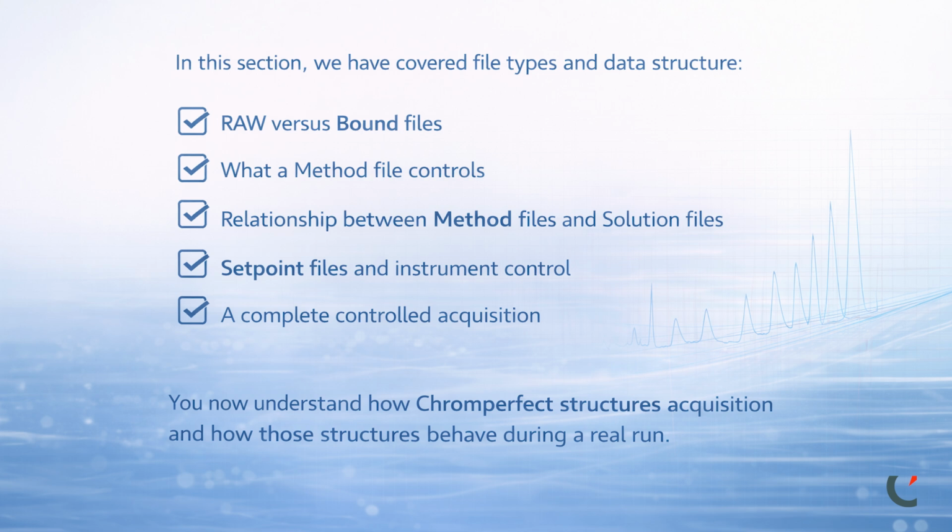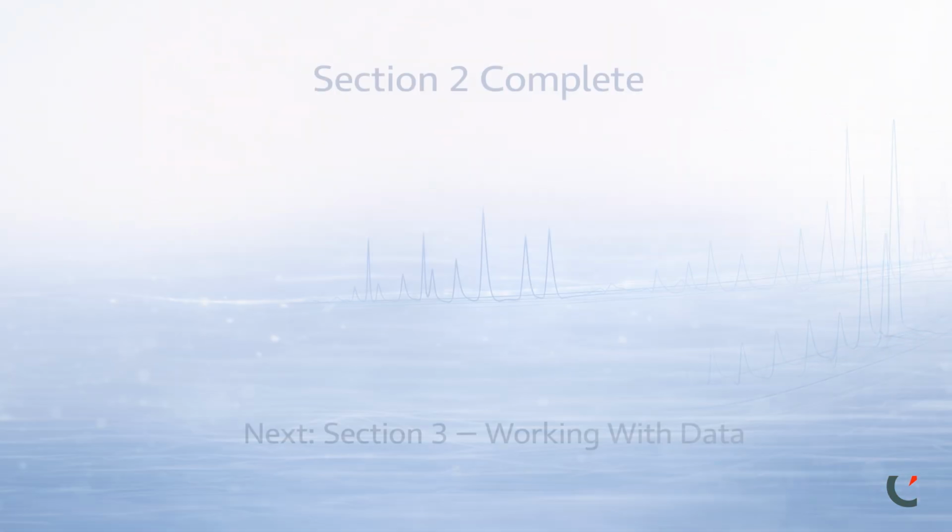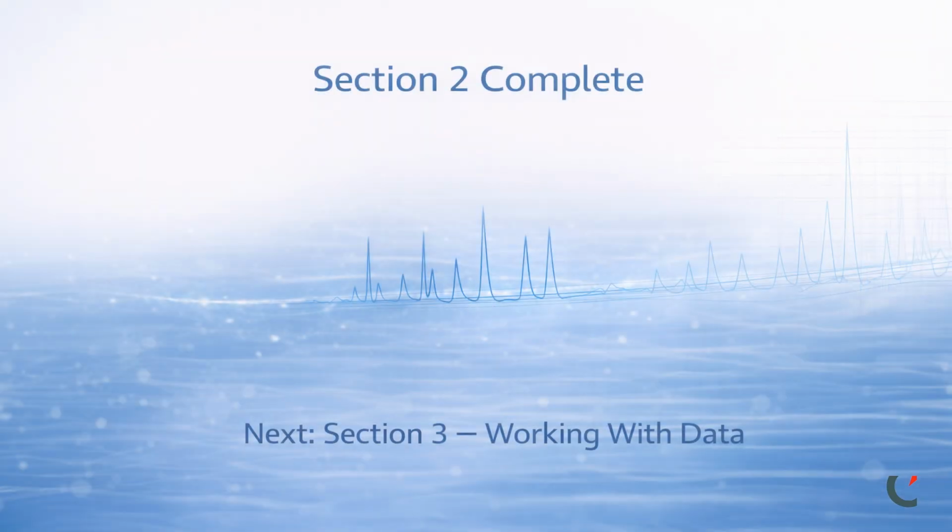This marks an important milestone. You now understand how Chromperfect structures acquisition and how those structures behave during a real run. In the next section, we shift focus from acquisition to working with data inside the Analyze program, including integration, calibration, and reporting.